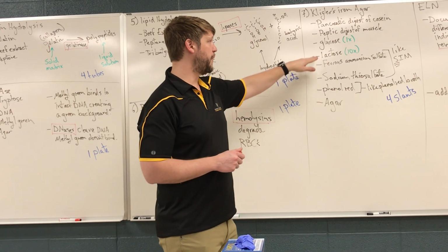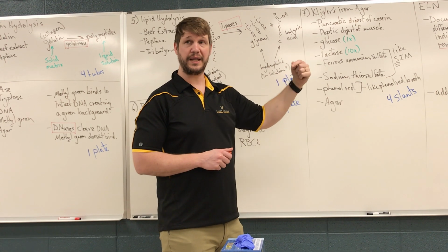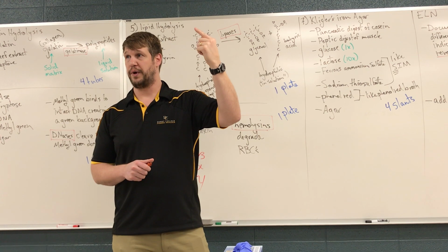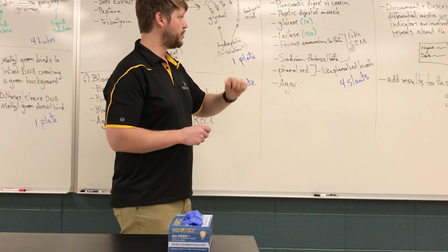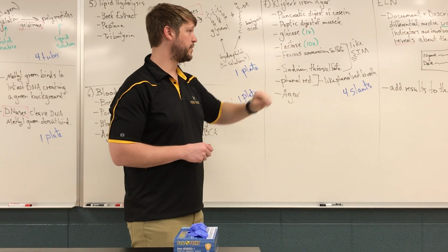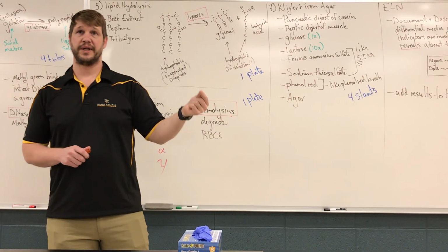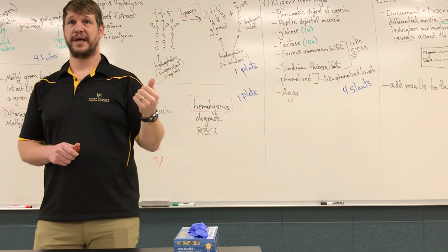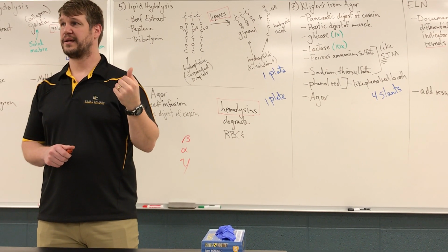So basically, if an organism is capable of metabolizing glucose but not lactose, initially you'll see it turn yellow, but then it'll turn purple, right? It'll go typically back to an alkaline state, drive the pH up, and that'll cause the phenol red to turn more of a magenta color. If, however, it can also use lactose, the organism will use the lactose instead of the protein, right? And that will maintain a yellow color. Does that kind of make sense?